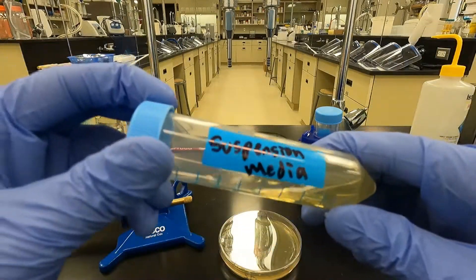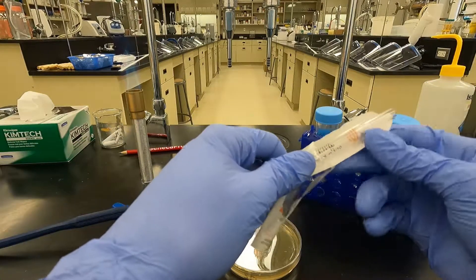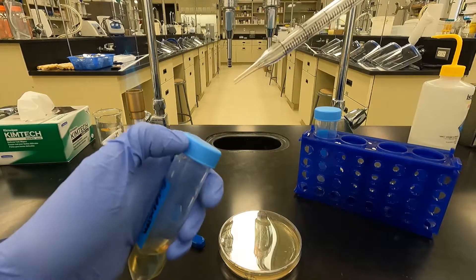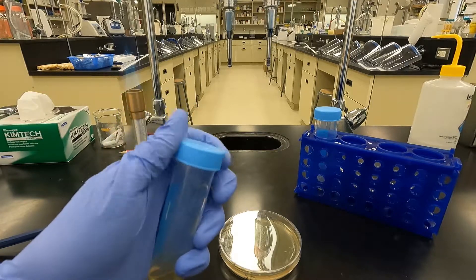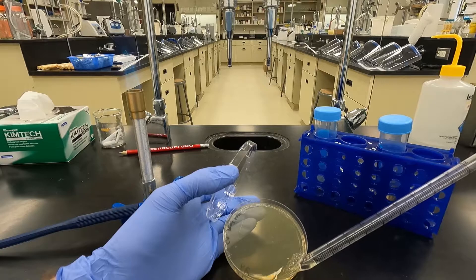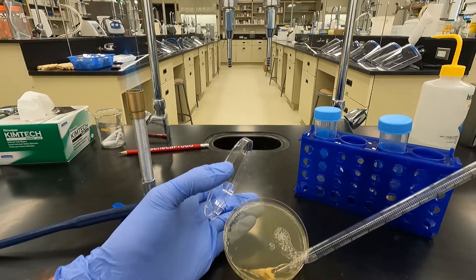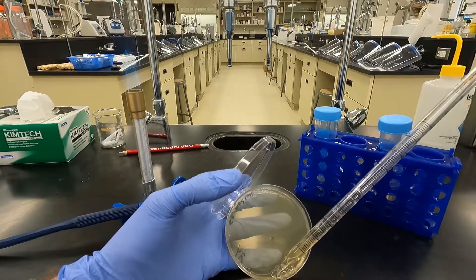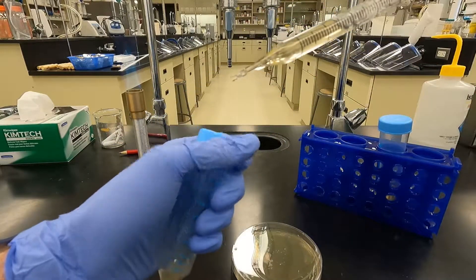Most of the lambda should be trapped in that agar, but I'm going to use some suspension media and just wash off the top of the bottom layer — three mils per plate. Just grab a pipette, pipette up those three mils of suspension media, give it a rinse, spray it down, pipette back up, spray it down a few more times. Collect as much phage as you can — anything that might have diffused downward. Really trying to get all of it for a nice high titer. Then add that to the top agar.